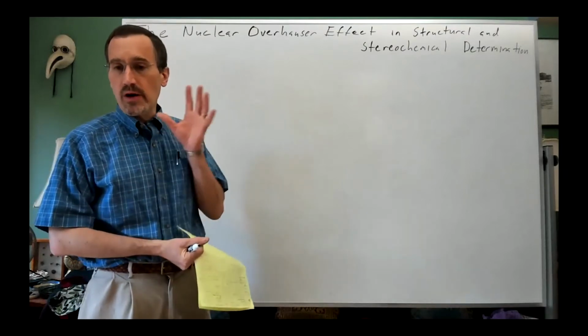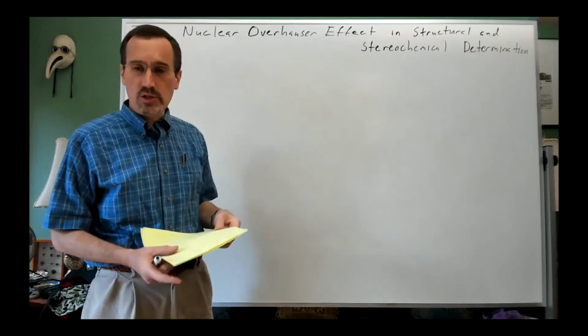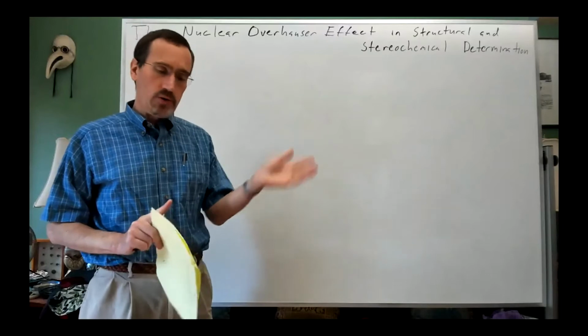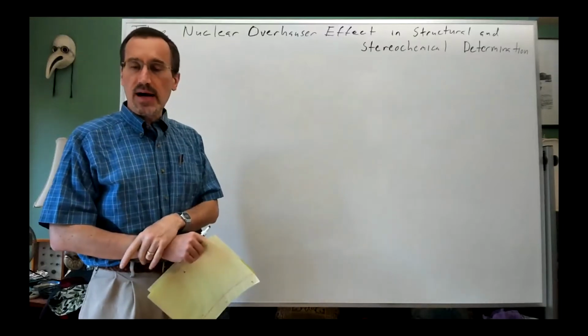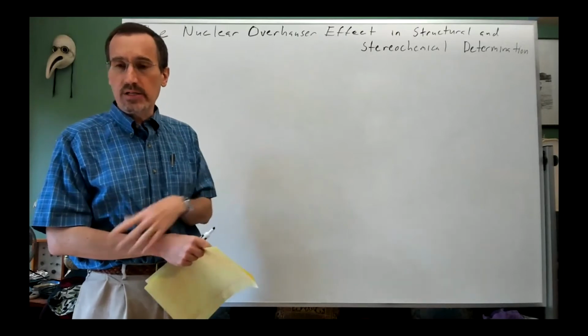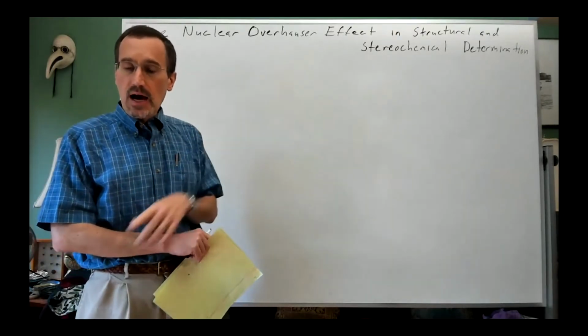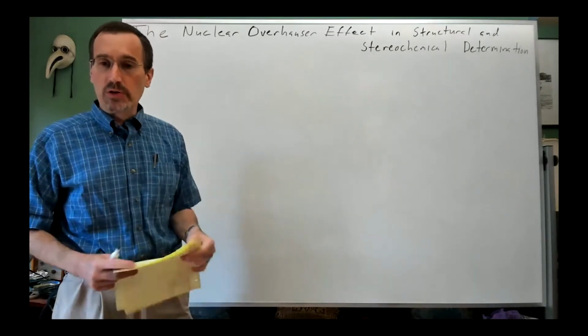Often you do a reaction or you have a very specific question that you're asking. You're doing an aldol reaction and you're asking, am I getting syn or anti stereochemistry, or Michael addition as we did to the nitrocyclohexene ring, or Diels-Alder reaction?